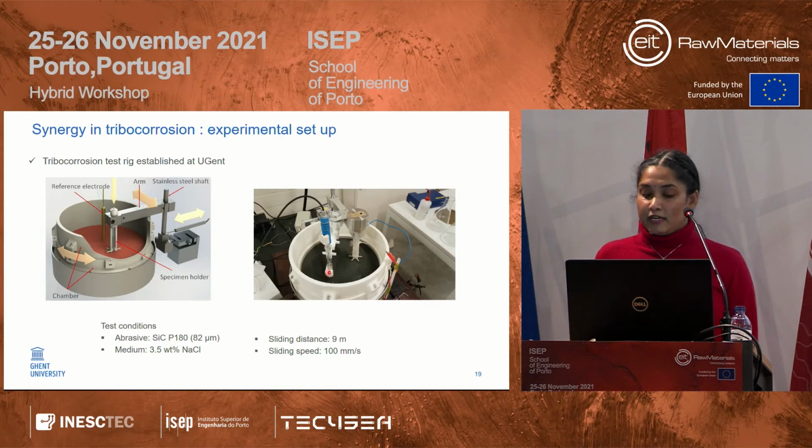This is because abrasion and corrosion work at different time scales. Corrosion may happen in years, but when you scratch a material against sand, there is immediate material removal. Therefore, to match those two time scales, we accelerate the process by applying an external current using these kinds of controlled electrochemical setups.